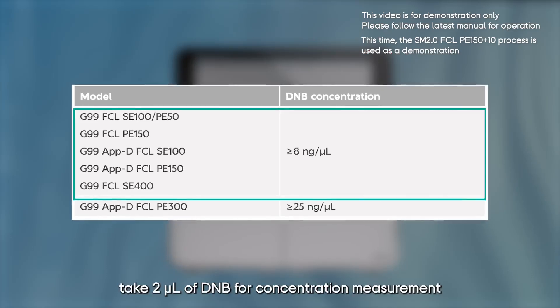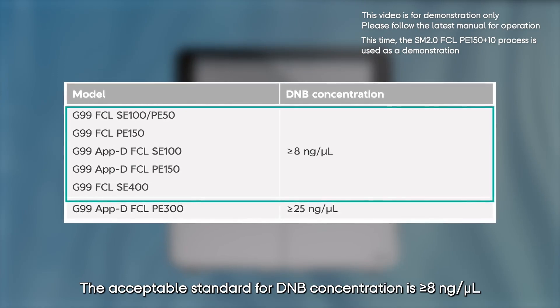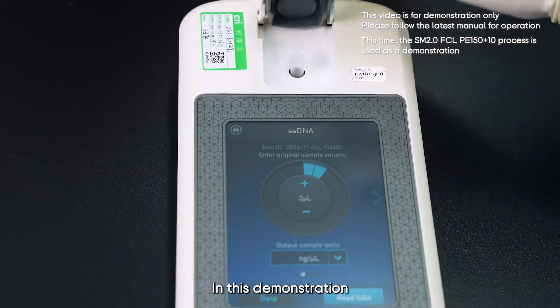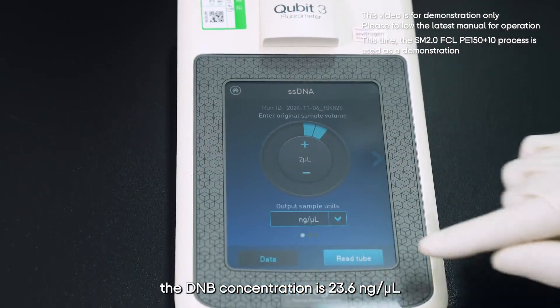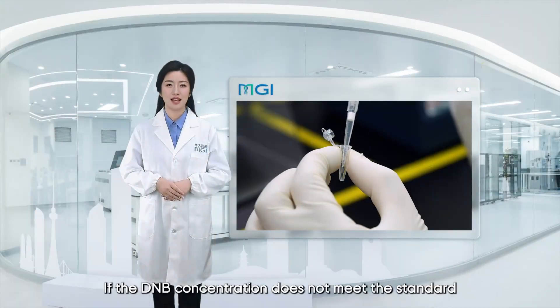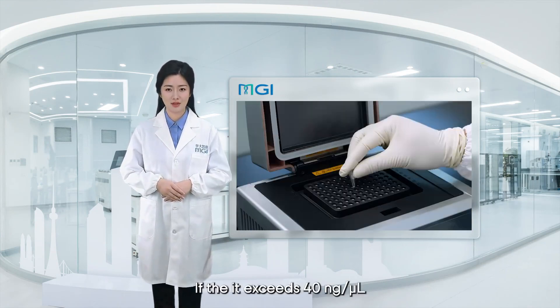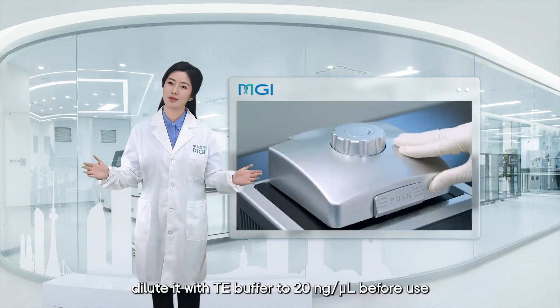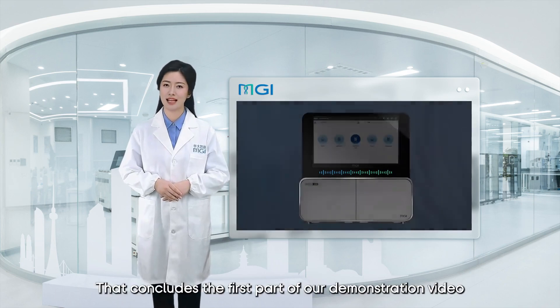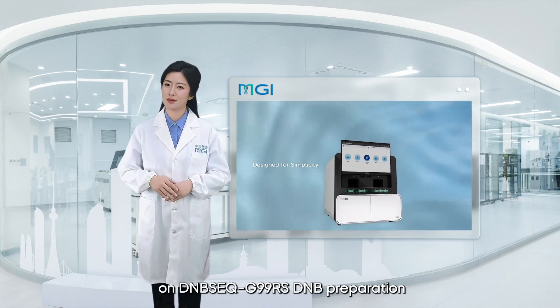Next, take 2 microliter of DNB for concentration measurement. The acceptable standard for DNB concentration is more than 8 nanogram per microliter. In this demonstration, the DNB concentration is 23.6 nanogram per microliter. If the concentration does not meet the standard, it needs to be prepared again. If it exceeds 40 nanogram per microliter, dilute it with TE buffer to 20 nanogram per microliter before use. That concludes the first part of our demonstration on DNBseq G99 DNB preparation.